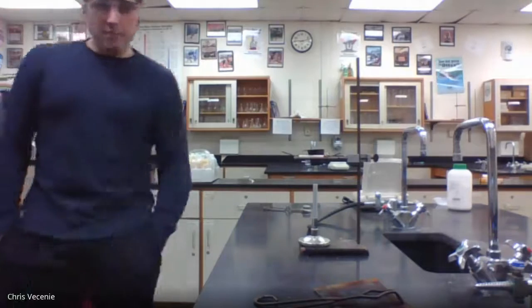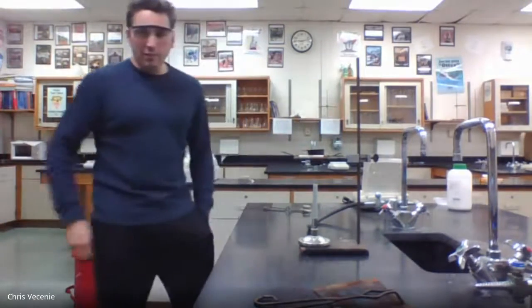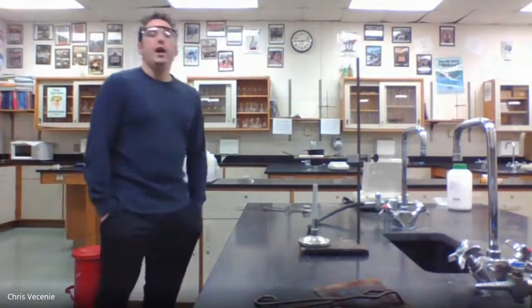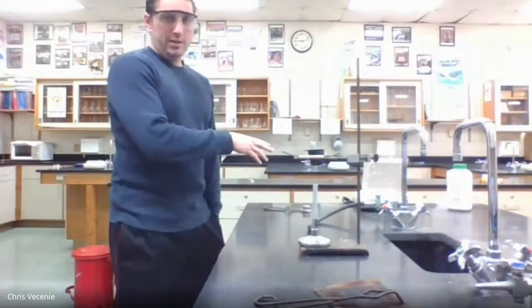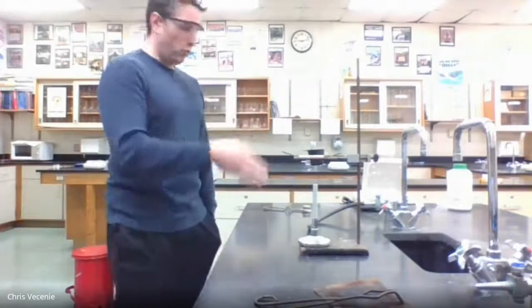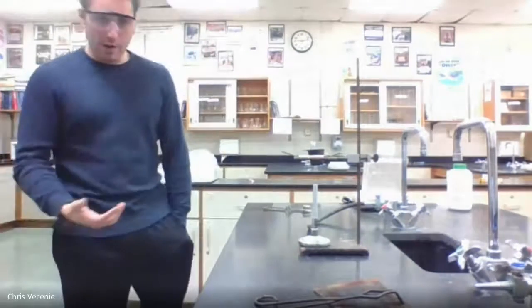All right, and for this part of the experiment, what I'm going to do is I'm going to get a mass of my crucible and my lid. I'm going to write that number down on a little side piece of paper. Then what you do is you reheat, cool, and mass again for 2 minutes. You just heat for 2, cool, mass. You repeat that process till you get the same number twice.